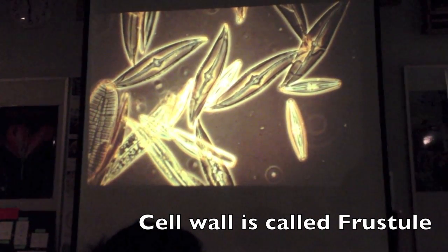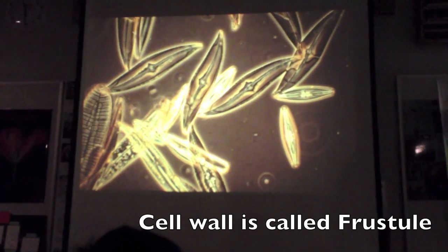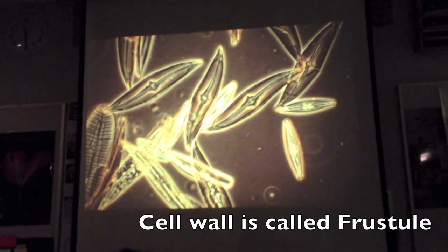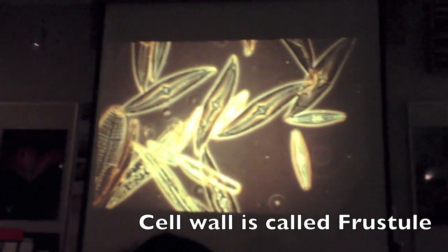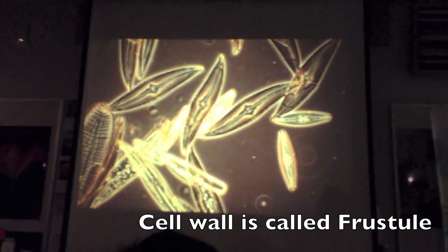Made out of glass. And frustule. Hypotheca and epitheca, but you can't tell which is which here. Right? Just know you've got a frustule. I think that's all the structure of diatoms we did.